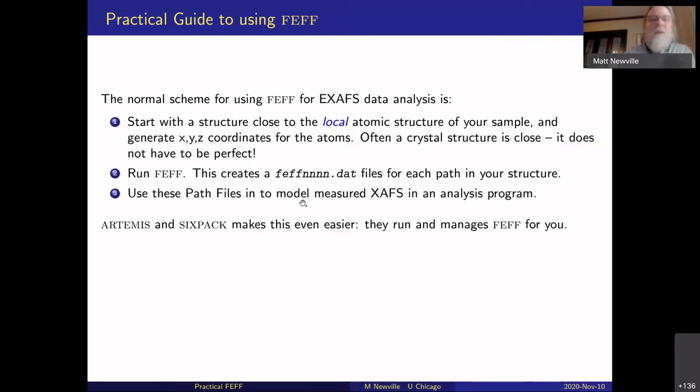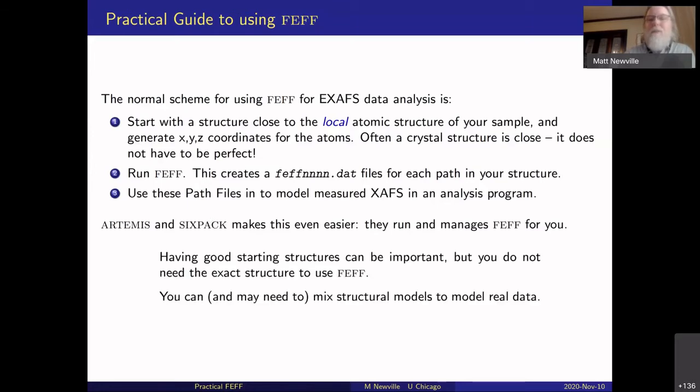And all of the programs, Artemis, Sixpack, Larch, make this easier. They run and manage FEFF for you. I will show you how to do some of that by hand, because, in my humble opinion, it's sometimes better to watch it happen than to just rely on magic. Although magic is good too.